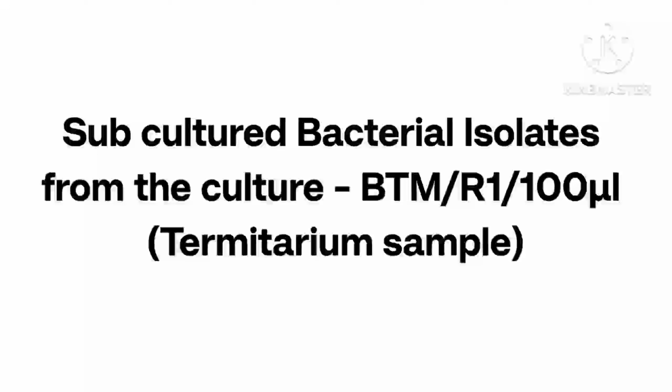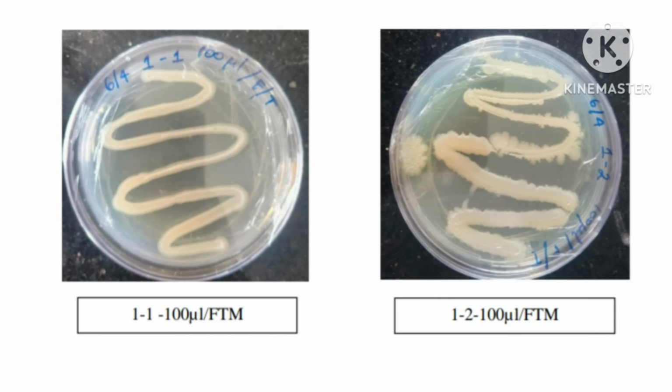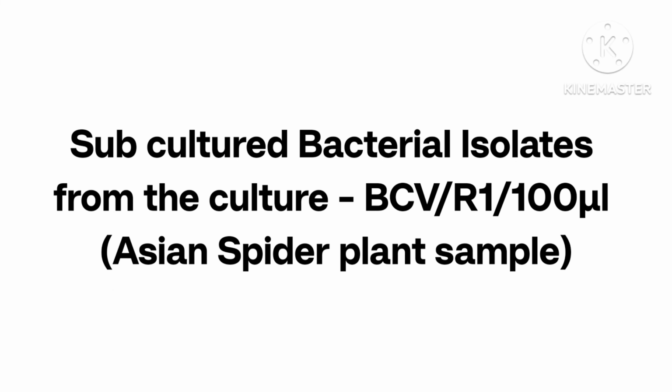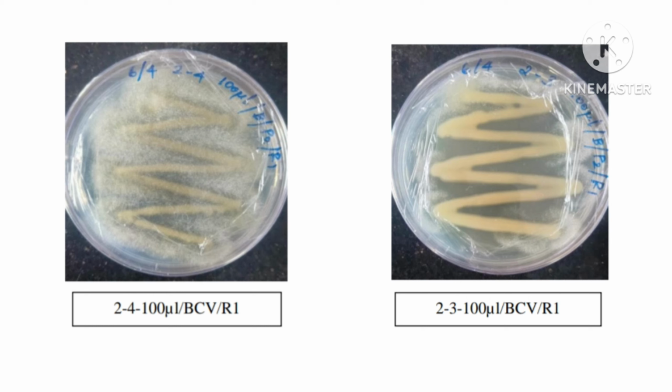Subcultured bacterial isolates from termitarium sample. Subcultured bacterial isolates from termitarium sample of replication 1 under 100 microliter dilution. Subcultured bacterial isolates from Asian spider plant sample. Subcultured bacterial isolates from Asian spider plant sample from replication 1 under 100 microliter dilution.